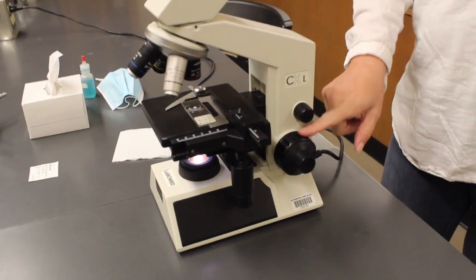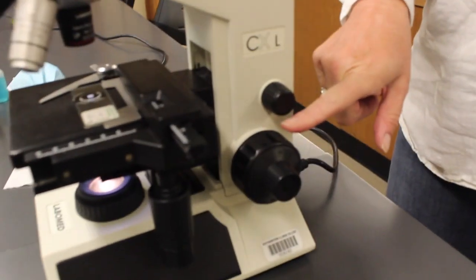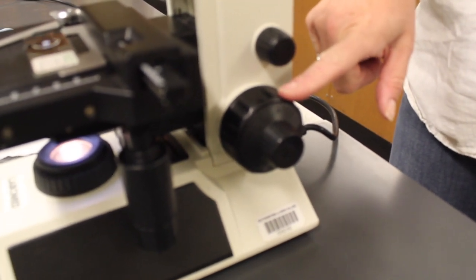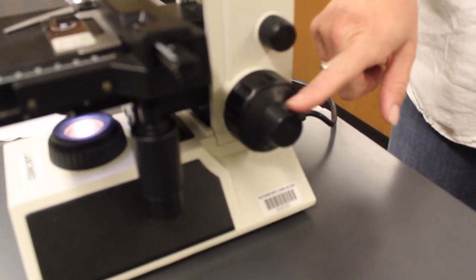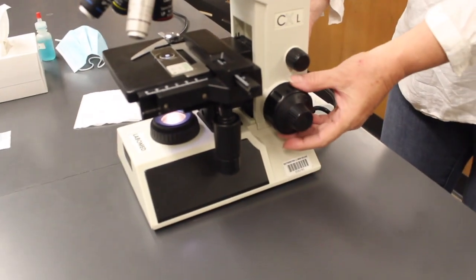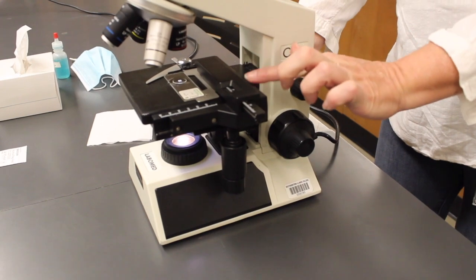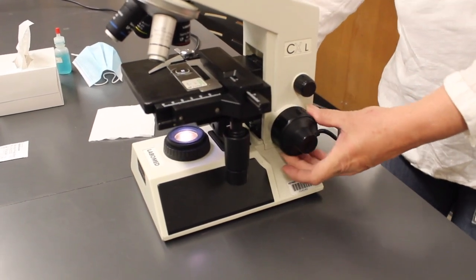Next, we're going to raise the stage using the focus knobs. This is the coarse focus or coarse adjust. And this is the fine focus or fine adjust. You can see as I move it, if I turn this coarse focus, the stage is actually going up. So you can see it going up.